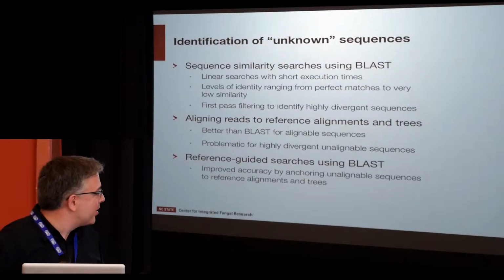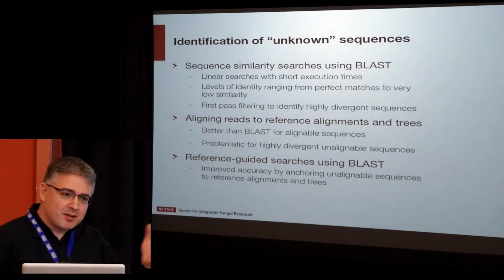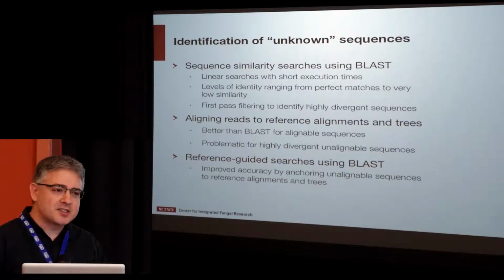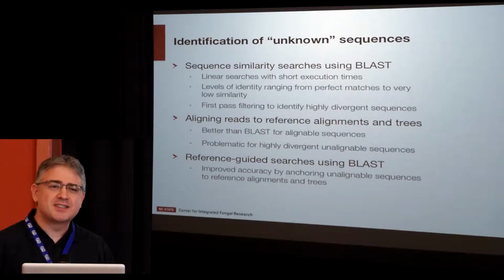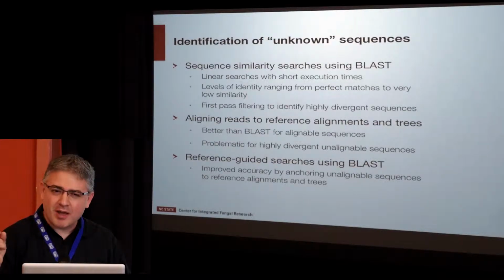So how do you overcome those? You do reference-guided searches using BLAST. And this is something that Francois mentioned. And this improves the accuracy because now you could do your BLASTs to the unalignable sequences, which did not get into the reference tree and the reference alignments. But you have an anchor now.